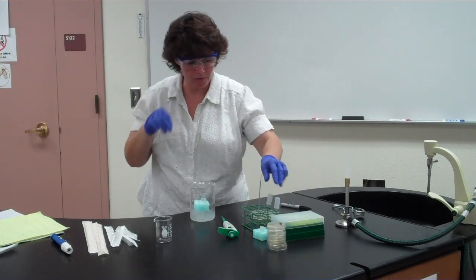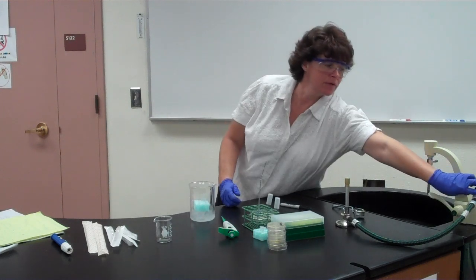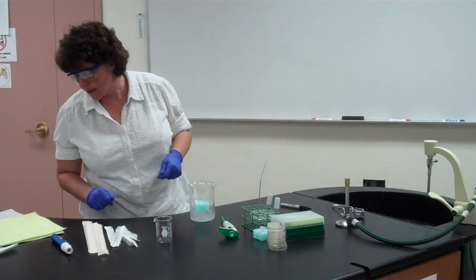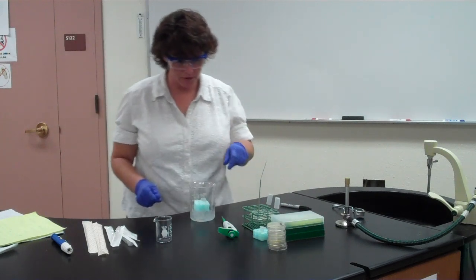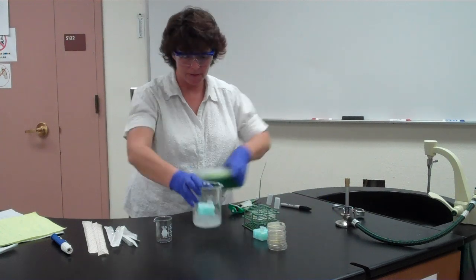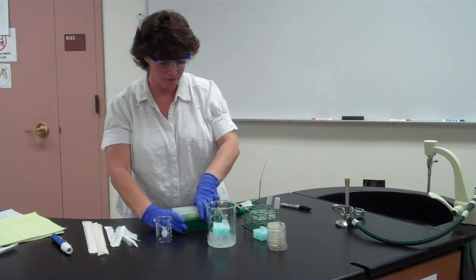So I put the calcium chloride in both tubes. I put the E. coli in both tubes. Now at this point, I don't need this right now, so I'm going to turn that off. Okay. Now we're going to pipette 10 microliters of our plasmid. Now the plasmid will probably also be on ice in the same container that the calcium chloride was in.